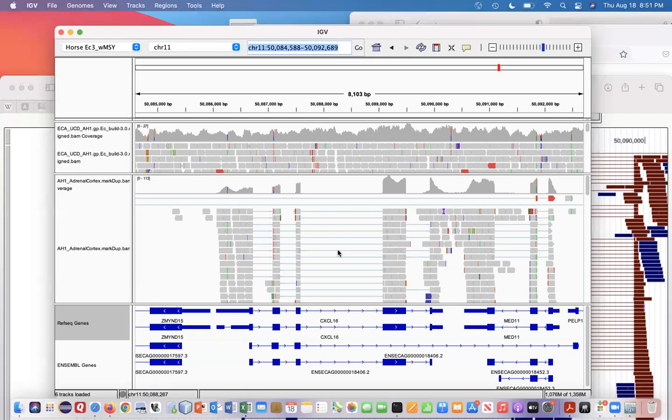These URLs and this server can handle moving these smaller bits of data very, very easily, very, very quickly, but the larger bits aren't going to work so well for it.